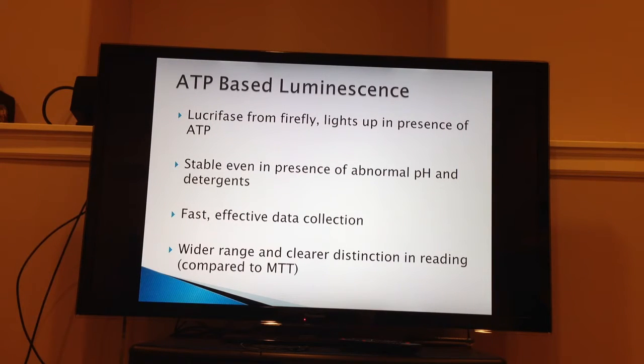For the ATP-based luminescence, I used a CellTiter-Glo Cell Viability Assay Kit, which is also a homogeneous method to determine the number of viable cells.